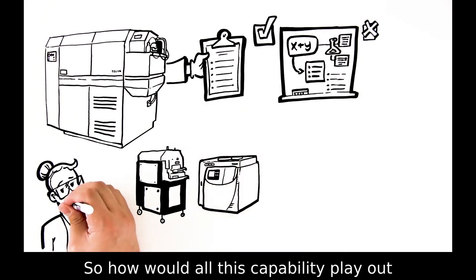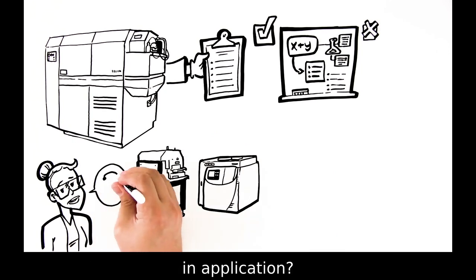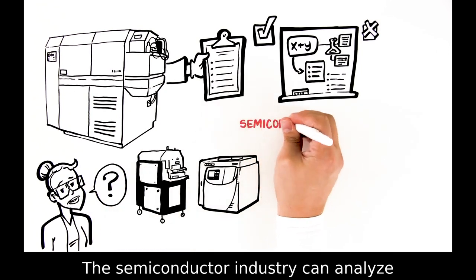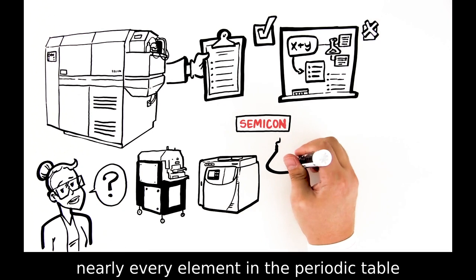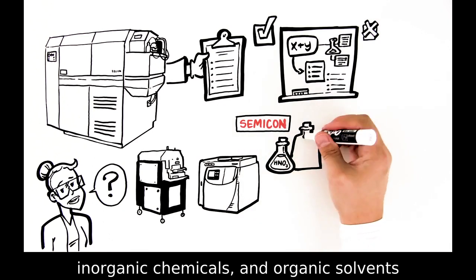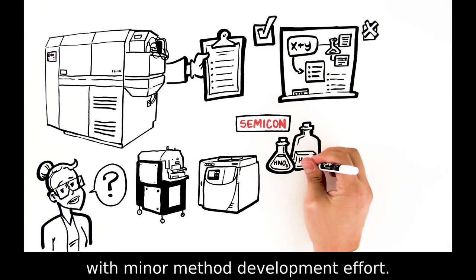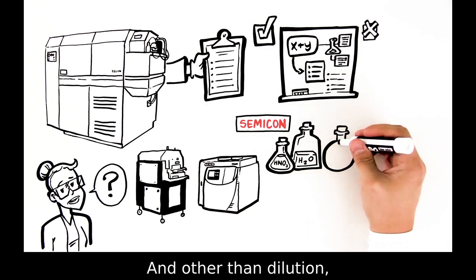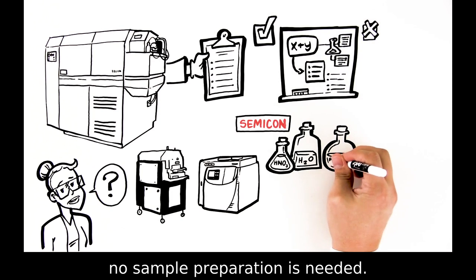So how would all this capability play out in application? The semiconductor industry can analyze nearly every element in the periodic table in ultra-pure water, mineral acids, inorganic chemicals, and organic solvents, with minor method development effort. And other than dilution, no sample preparation is needed.